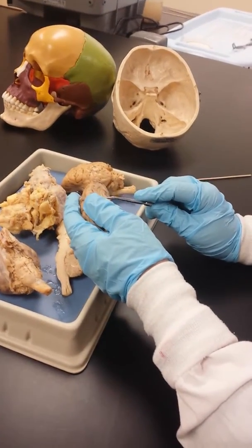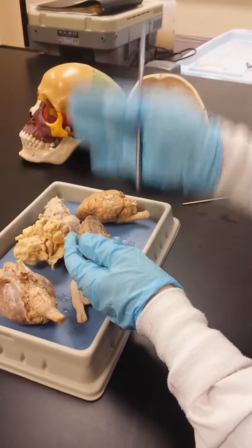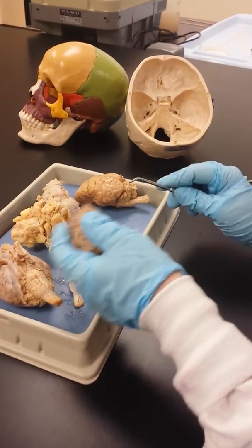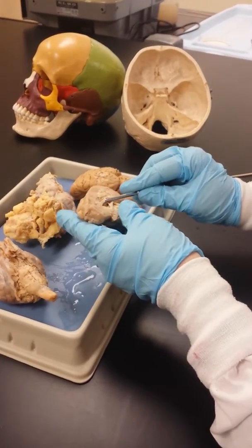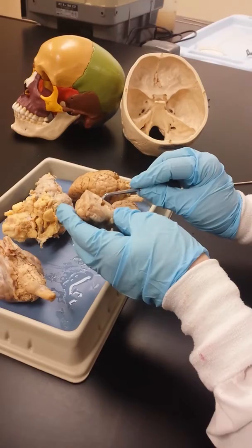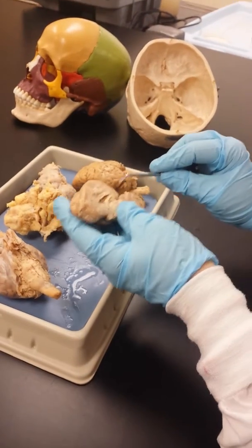Underneath this little flap is one of the lateral ventricles. There's a little tissue that goes right between the two to keep them separated, and we call that septum pellucidum, and that's what you see right here, that tissue. If you look on this one, there's nothing there, and so this is a lateral ventricle as well. And inside the ventricle we've got real important stuff as well, which you guys don't have to know, but there's lots of cool stuff in there.